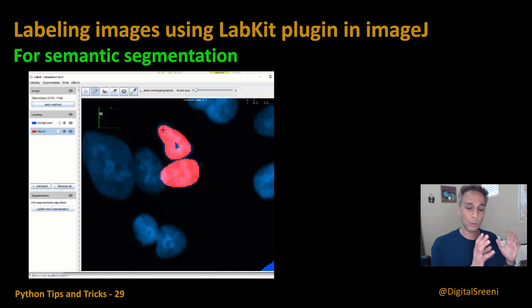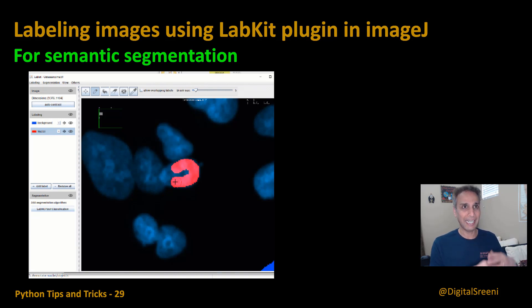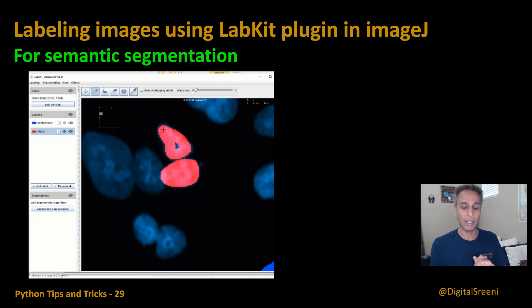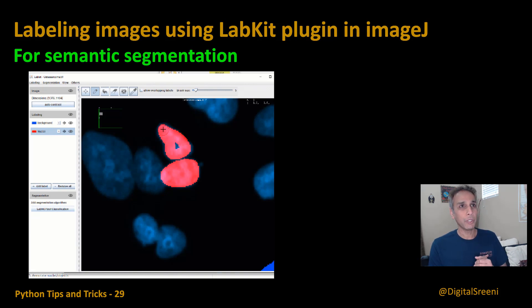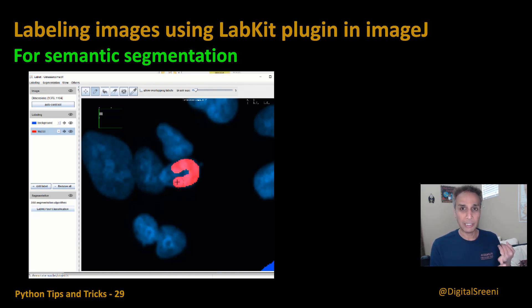If you are into image analysis, image processing, then this is an amazing piece of free software that I hope you can download and explore.